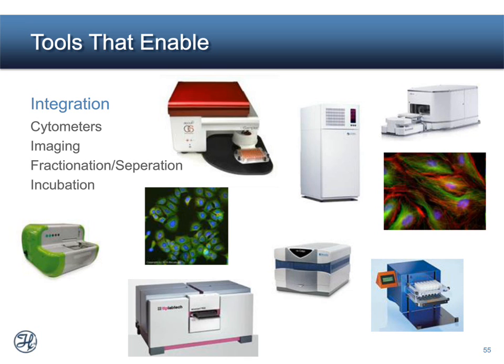So things such as how integrating cytometers, imaging systems such as the BioTek instrument you saw earlier, what types of devices can be integrated in terms of fractionation separation, so magnetic separation devices or centrifuges, as well as incubators is one of the most important things in cell culture processes. So how the incubators handle their inventory and how they integrate with the vendor liquid handler platform.